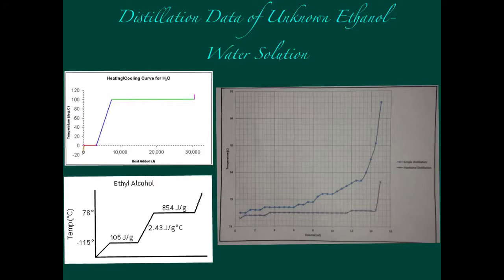Only the more volatile substance is physically able to flow through the column, where we then record its temperature and collect it in the apparatus receiver. We obtain a much purer substance by this technique, which is slower compared to simple distillation.